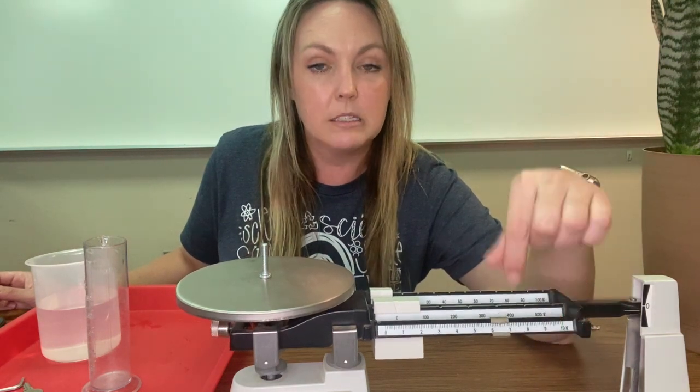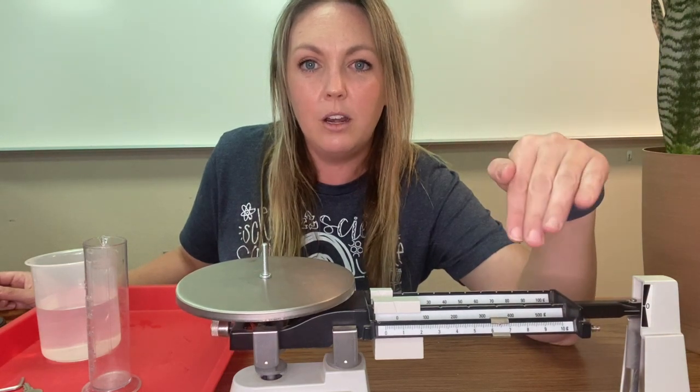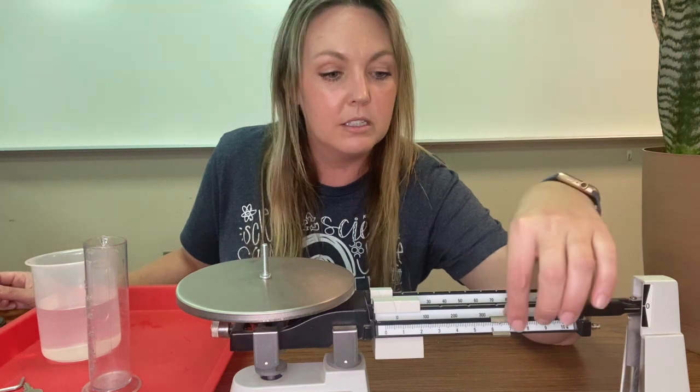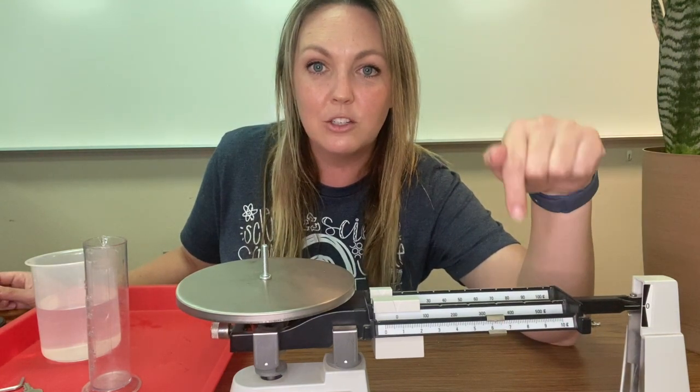I should say it has more mass. You've got to wait and have a lot of patience for it to balance out. Sometimes it's not by much, but you've got to move it.